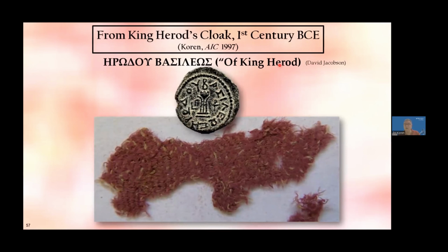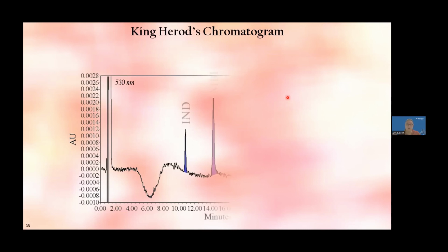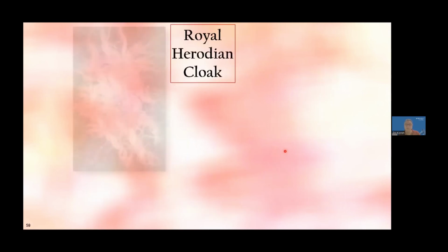Here's this textile under natural light, but when you analyze it under magnification and very high intensity light, you get a nice coloration that you'll see. And here's a 2,000-year-old chromatogram, a beautiful rendition that shows you that this came from a purple pigment.